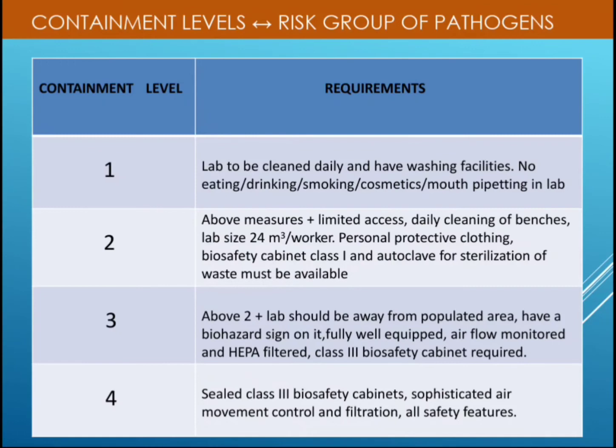Laboratory size should be 24 cubic meters per worker. Okay, means every worker should get 24 cubic meters of space in the laboratory. Then personal protective clothing should be worn by the personnel. A class 1 biosafety cabinet and an autoclave for sterilization of waste must be available.